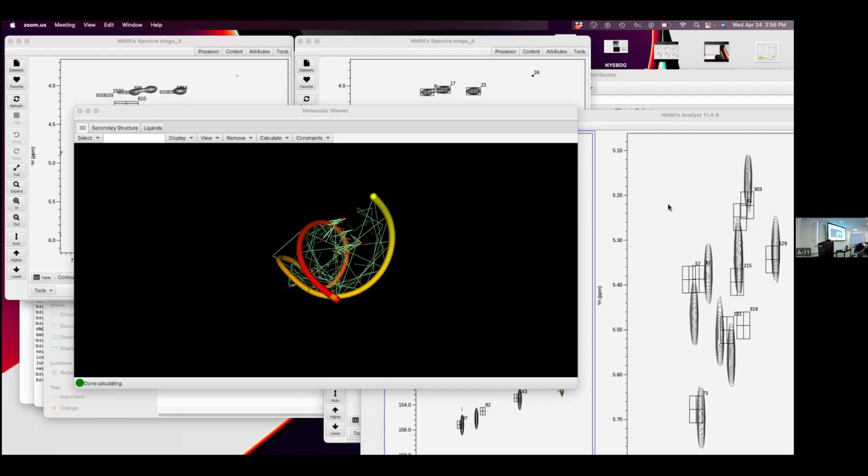I don't see an acqus file, so that's probably the problem. It can't just have the ser file, it needs to find sweep widths, the spectrometer frequencies and all of that. So they should have the entire folder. That is definitely the starting point. The ser file is just a series of bytes that are the intensities of the FID, but you can't even tell how many dimensions there are from just the ser file.